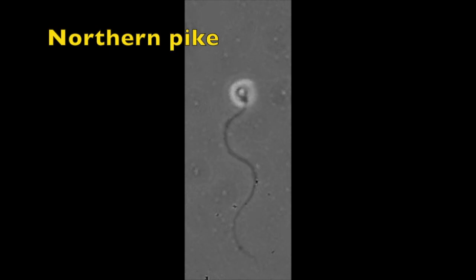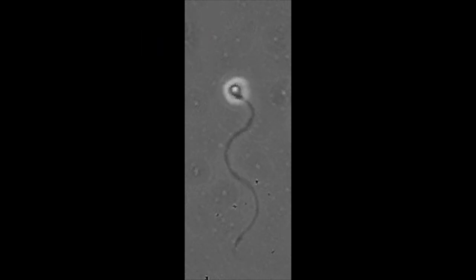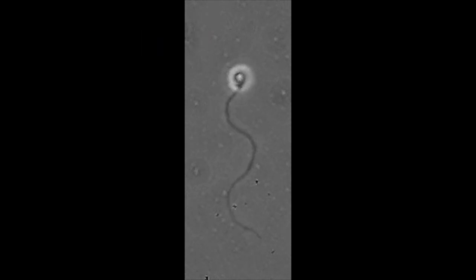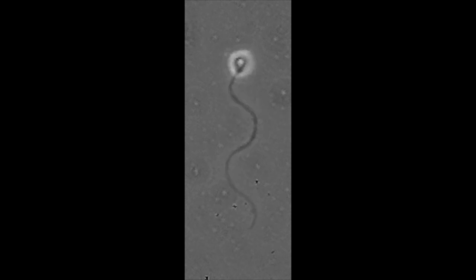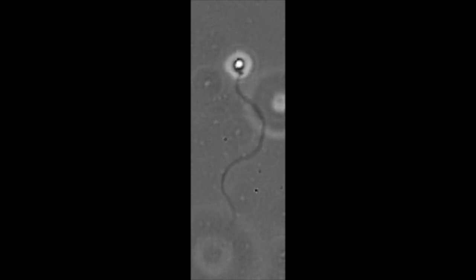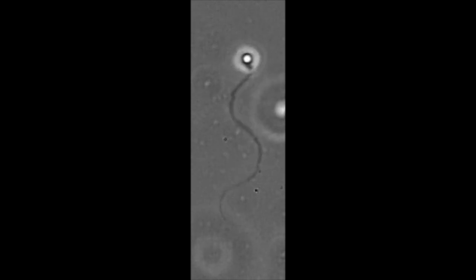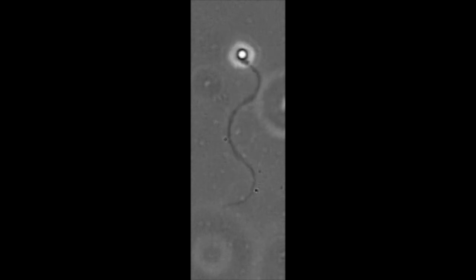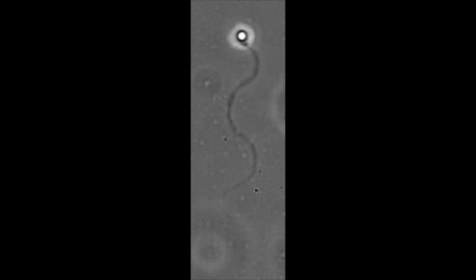This is a close-up view of spermatozoa from Northern Pike. A careful observation of the flagellum shows locally some blebs which are resulting from the osmotic shock at activation.